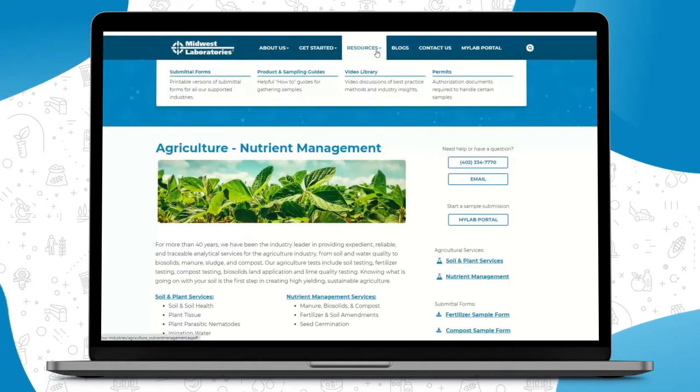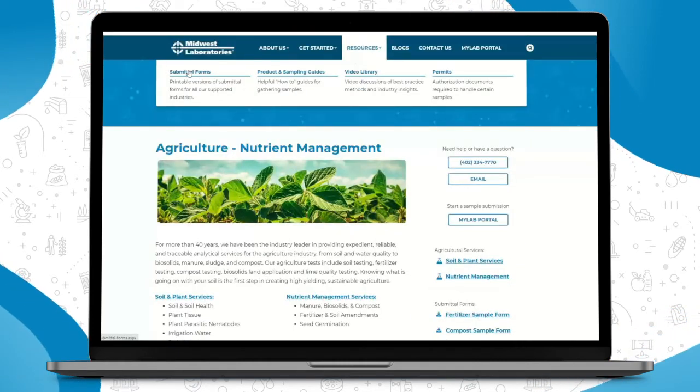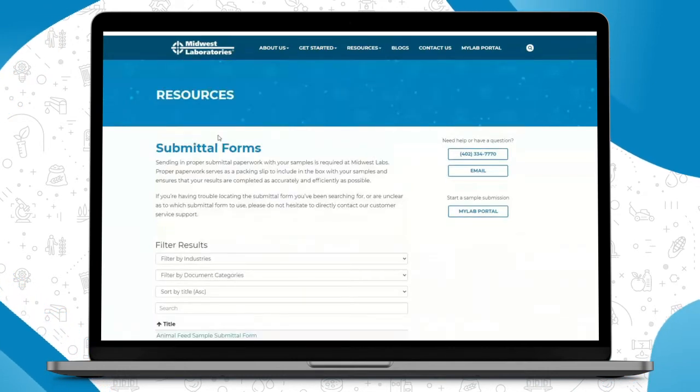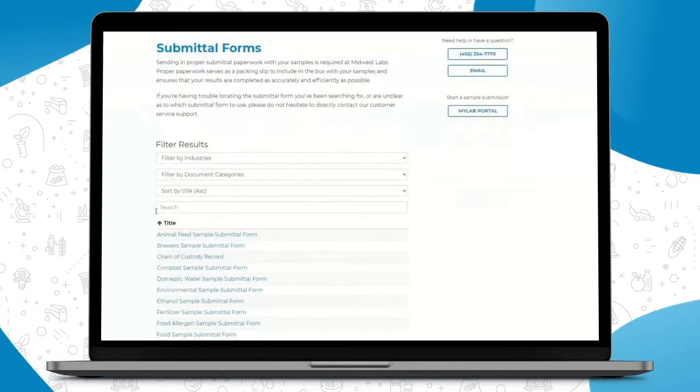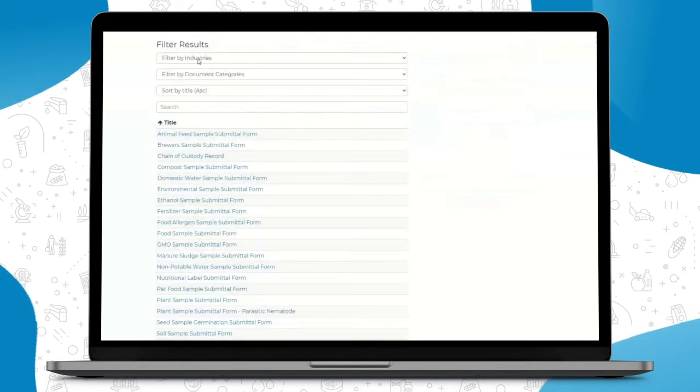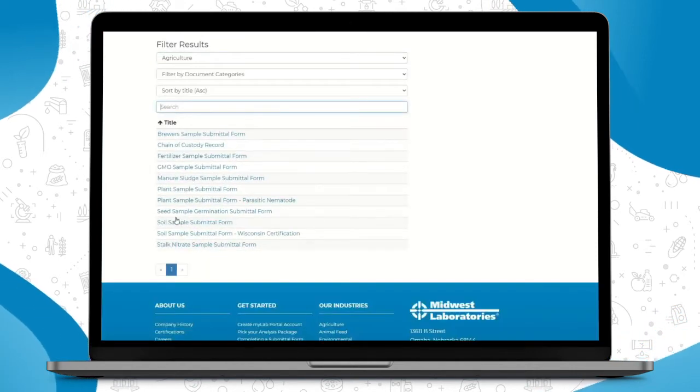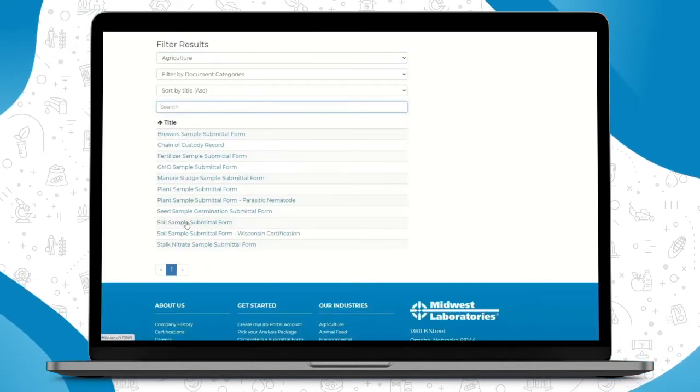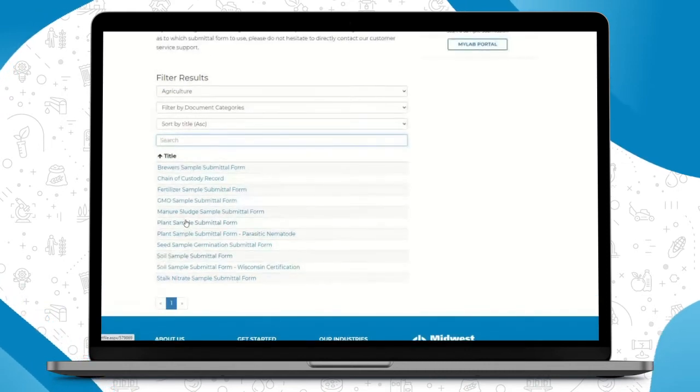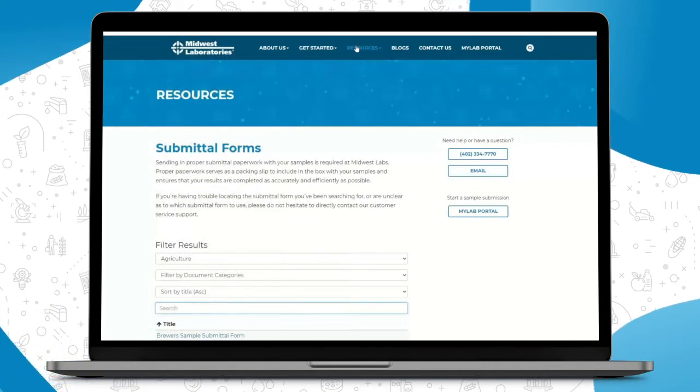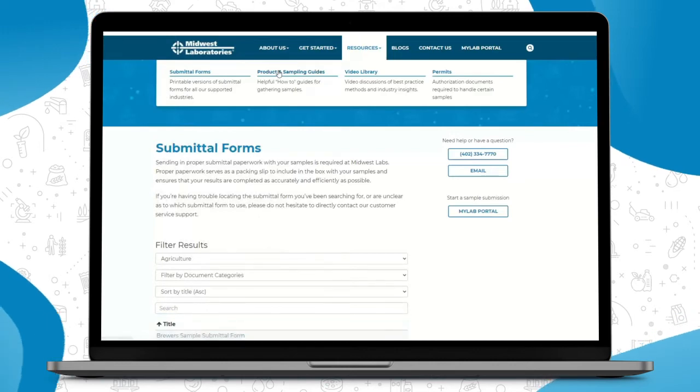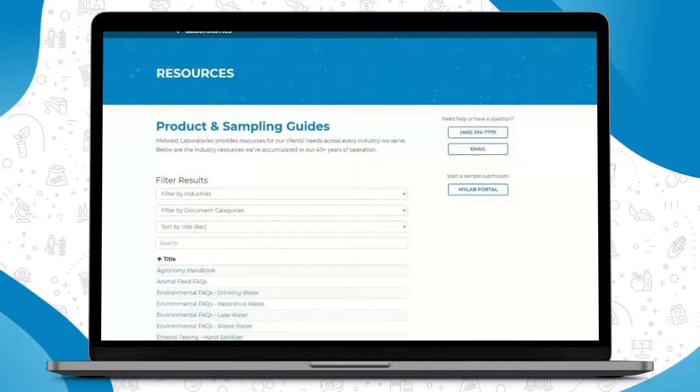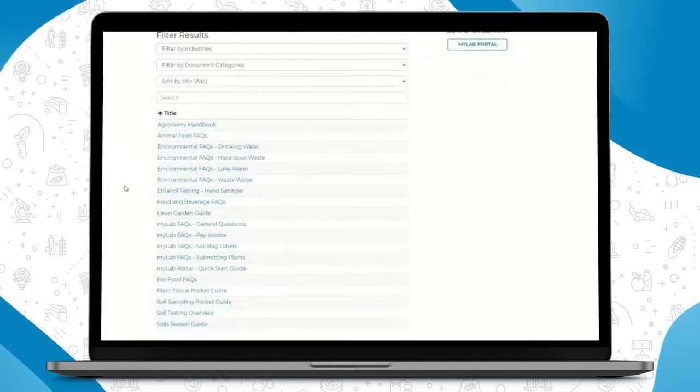Our Resources tab is another helpful tab we've added. You can go here again to print off your handwritten submittal forms if you're choosing to do it that way. This is where you can find them by industry. So if you're looking for a soil submittal form, it'll be under agriculture and so on.